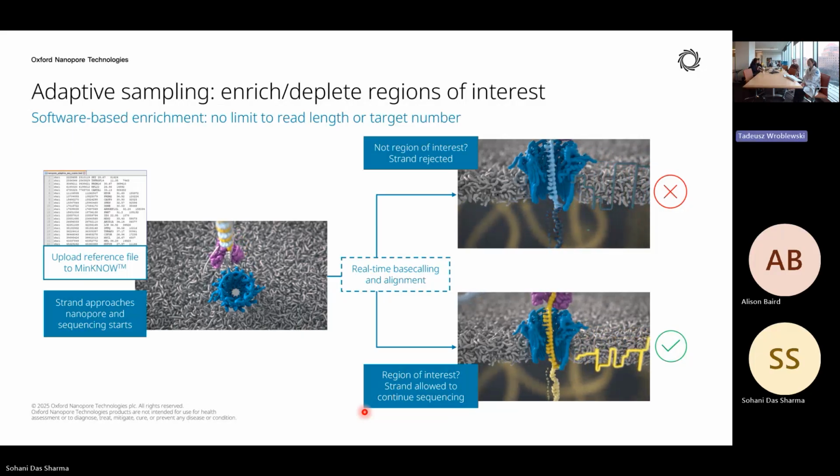It might not be an important application for cfDNA, but when we are thinking about gDNA, like the entire genome, and we are specifically interested in, let's say, a particular group of genes. Specifically, I have seen oncology clinical labs using this application a lot, because there is no need for extra bench work or wet lab steps for enriching a particular targeted region.